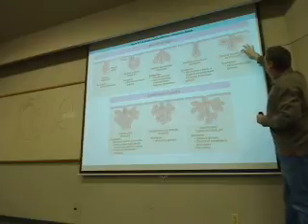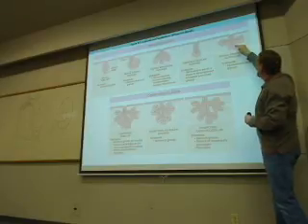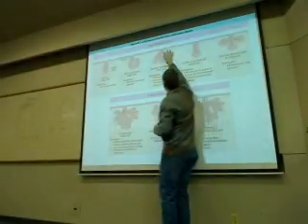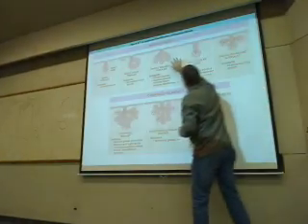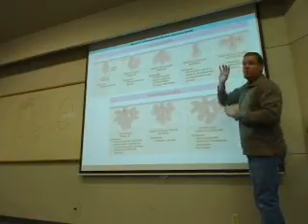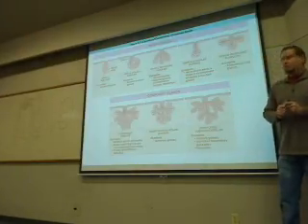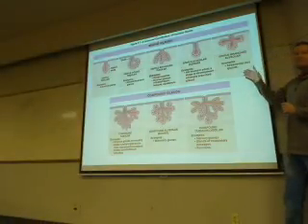So this guy is called simple branch alveolar. So the shape is alveolar and simple branch because what happens is this neck, just like with this neck, all of the branches or the different alveolar shapes, or in this case tubular shapes, they all connect where that opening is. So that's why it's called simple branch, because everybody's connected to that one common opening. Okay? Make sense?